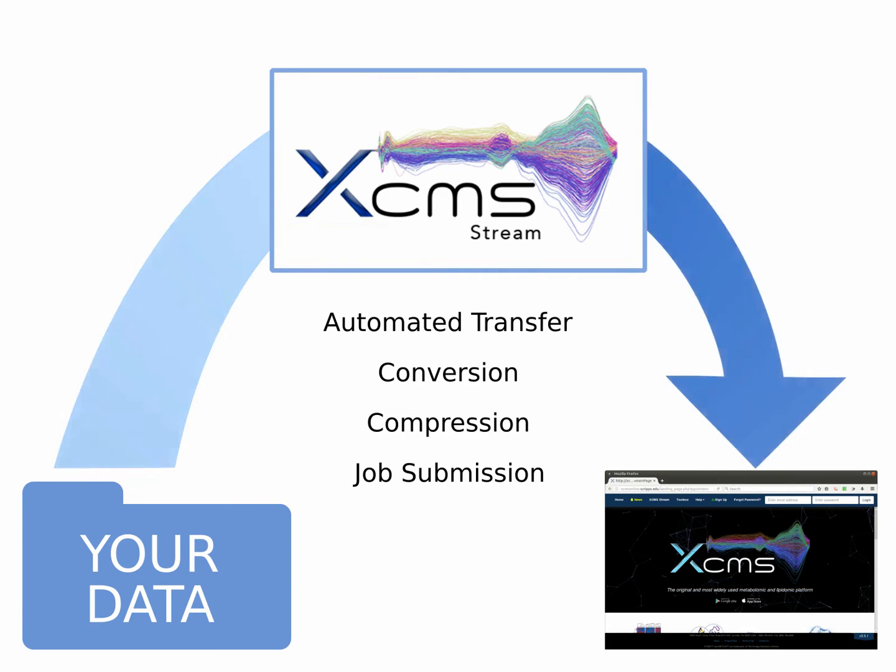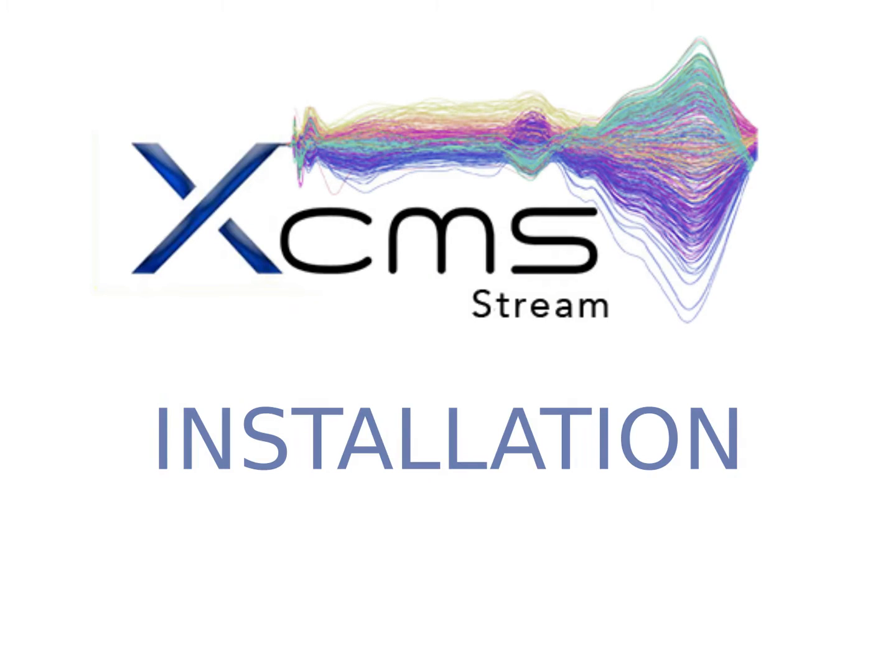In this tutorial, we will walk you through how to stream your data and submit a job in both online and batch mode, which we will cover in more detail later. For instructions on how to install the software, please watch Installing XCMS Stream.